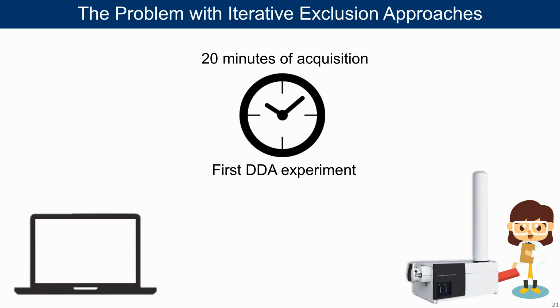We published this work in 2017, and it has over 50 citations, and many people are using this in fields ranging from lipidomics, metabolomics, and contaminants all the way to adductomics, and it's very interesting to see the unique applications. The problem is that technicians and researchers don't like the technique because of how tedious it is.